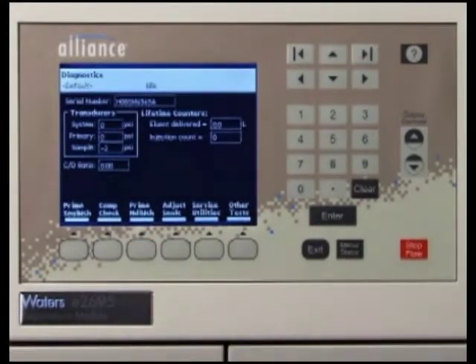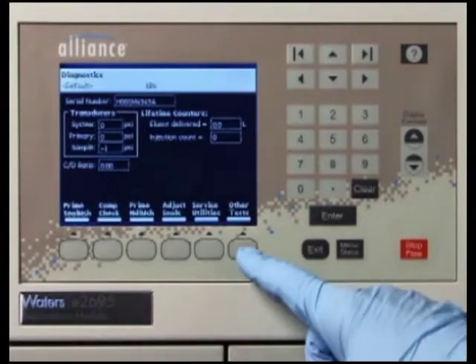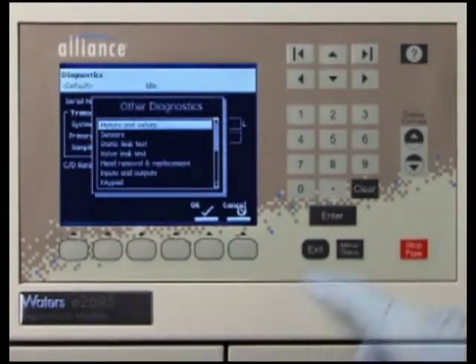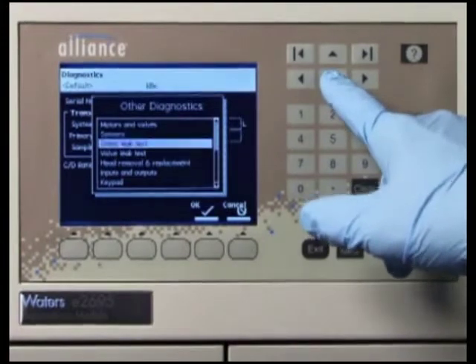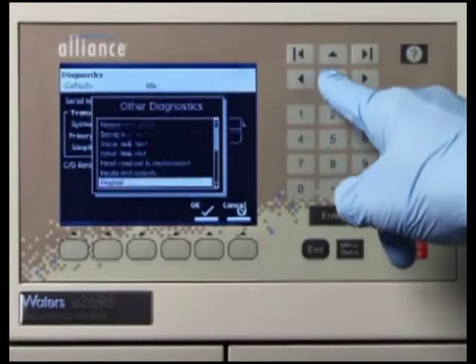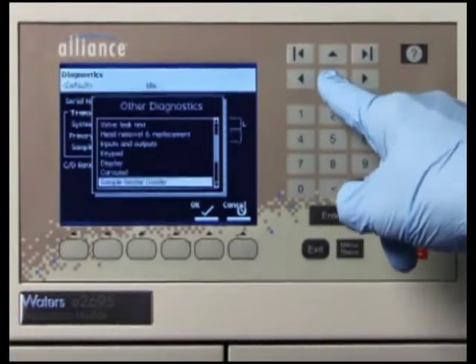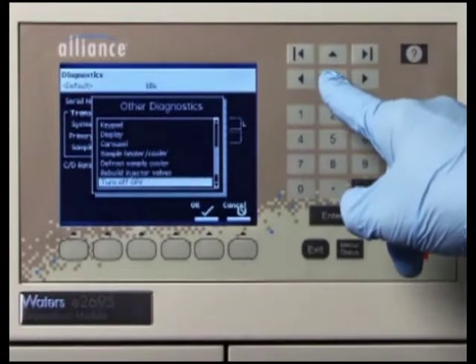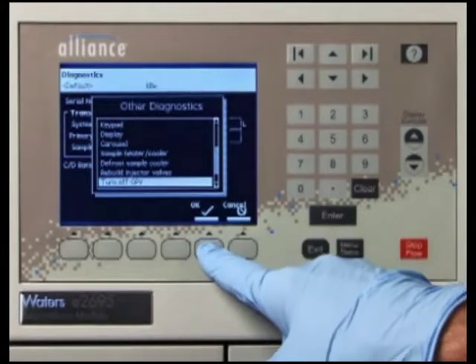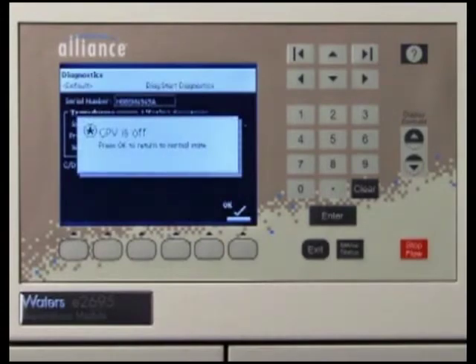The Diagnostics screen appears. Next, press the Other Tests key and select Turn off GPV from the list. Then press OK. A message box appears indicating that the gradient proportioning valve is off.